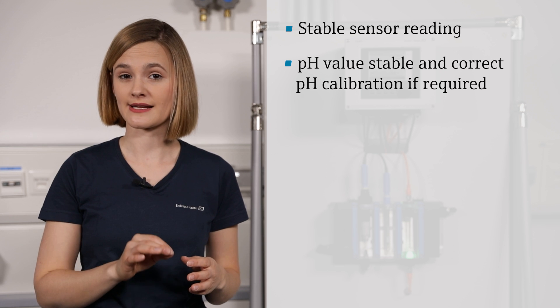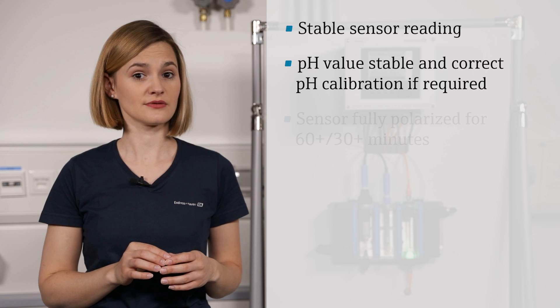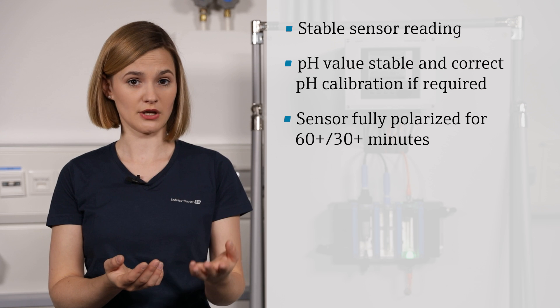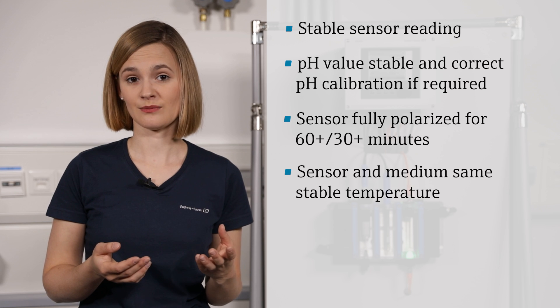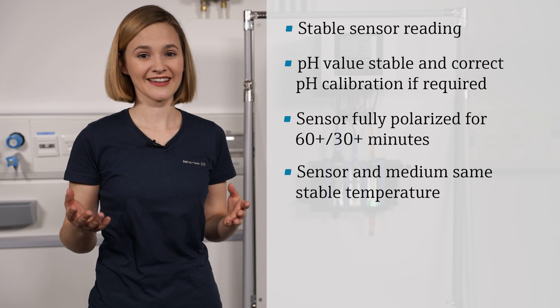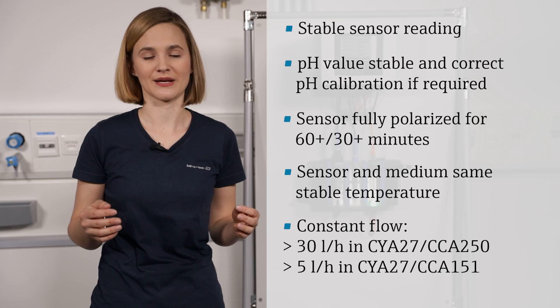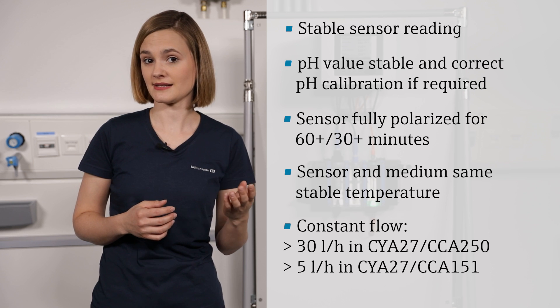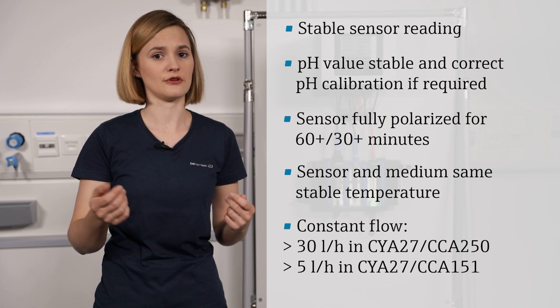Wrong pH measurement results in wrong chlorine values, no matter how perfectly you perform your DPD reference test. If your sensor is still polarizing, the measuring values are not plausible — you have to wait until it's fully polarized, which is at least 60 minutes after installation or 30 minutes after maintenance. The flow of the sample medium must also be constant and within the correct range — at least 30 liters per hour in a standard CYA27 assembly, or 5 liters per hour in a reduced flow version.